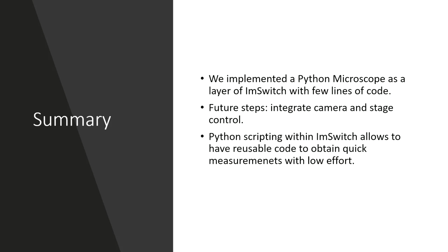And in future steps, we will also be able to integrate both the camera and the stage control into ImSwitch from Python Microscope. Finally, we have shown how Python scripting within ImSwitch can be used to have reusable code to attain quick measurements with low effort. Thank you for your attention.